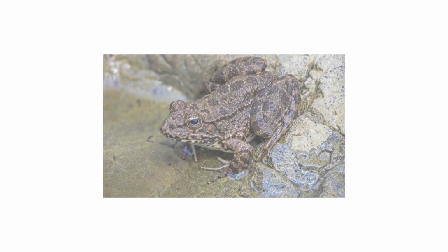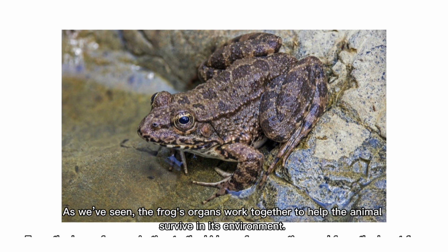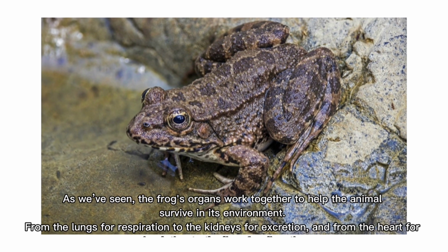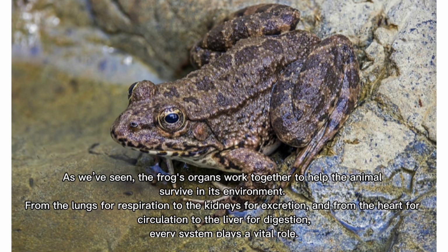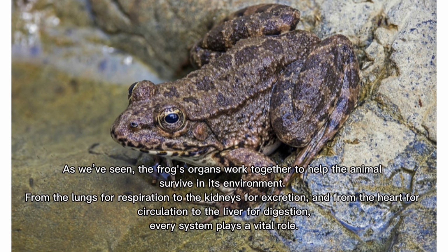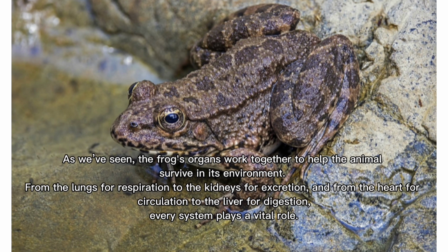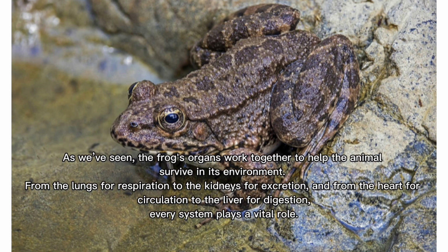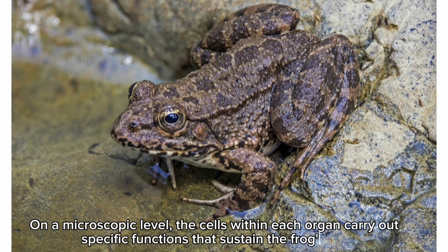As we've seen, the frog's organs work together to help the animal survive in its environment. From the lungs for respiration to the kidneys for excretion, and from the heart for circulation to the liver for digestion, every system plays a vital role. On a microscopic level, the cells within each organ carry out specific functions that sustain the frog's life.